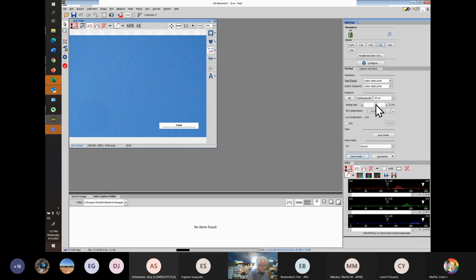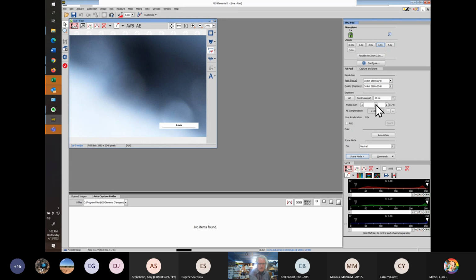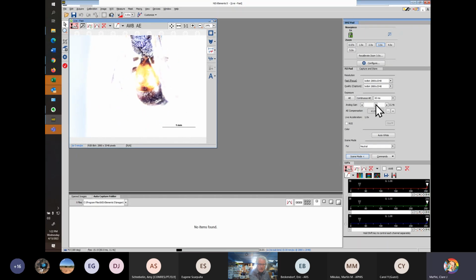But you know what? I'm not sure. I think I have a better specimen than this one. I want to show the red abdomen. There are these black abdomen ones there, and so ornatus can have a black abdomen. It's not supposed to, but we've figured that out at least now. And it can have a red abdomen, like hopefully we'll see here. Oops, I am showing the dirt. Oh, there we go. So you can see the nice red abdomen in this one. That would be the classic case.